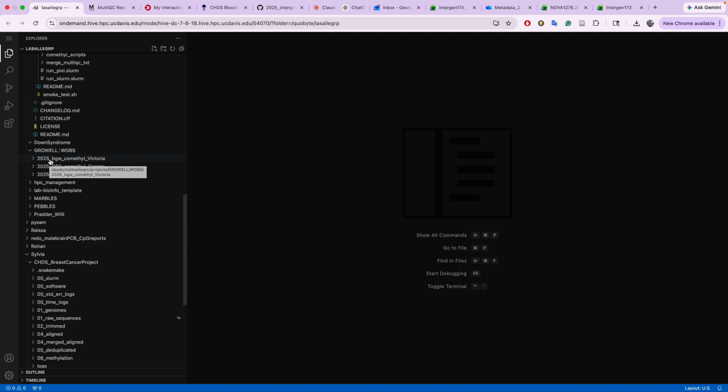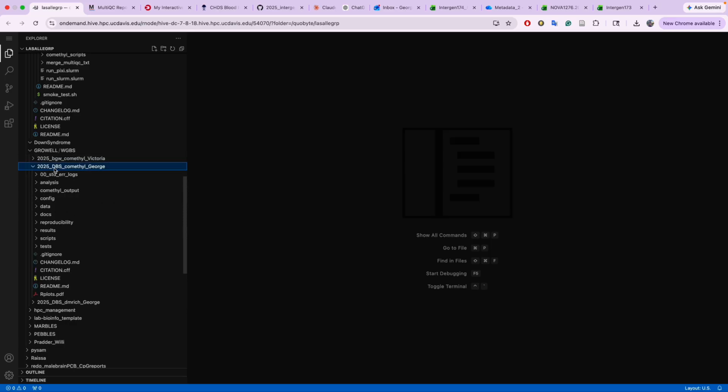I want to make a mini dataset that only has chromosome 22. That would help with troubleshooting stuff faster. So let me see. Which one did I do recently that has a mini data?